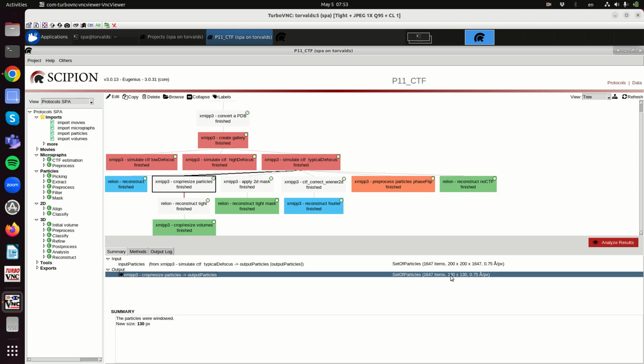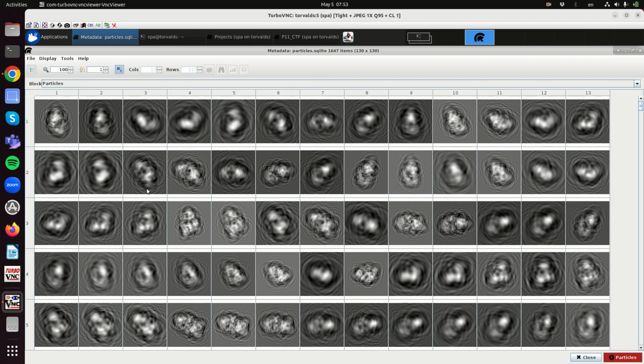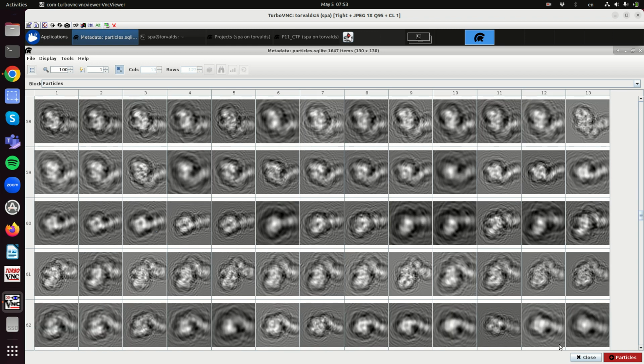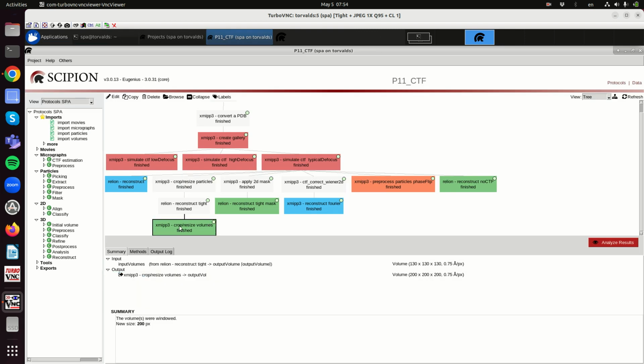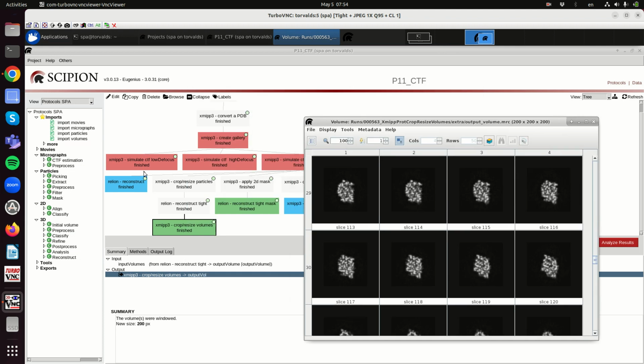So if we now change the box size, part of the information that was spread around is cropped. That means we no longer have that information. So does it affect the 3D reconstruction a lot? We can make a reconstruction, and then I put it back to the size of 200 just to make everything comparable. We see that especially when we compare to the perfect one.